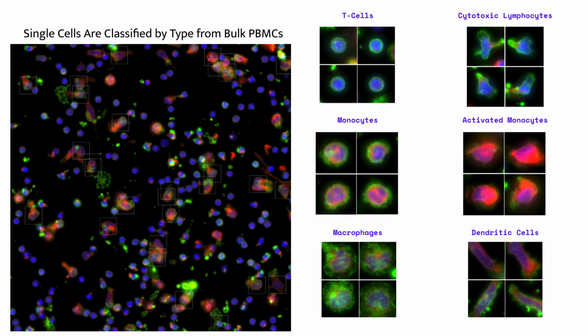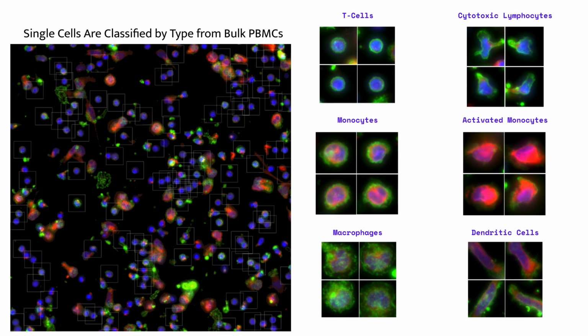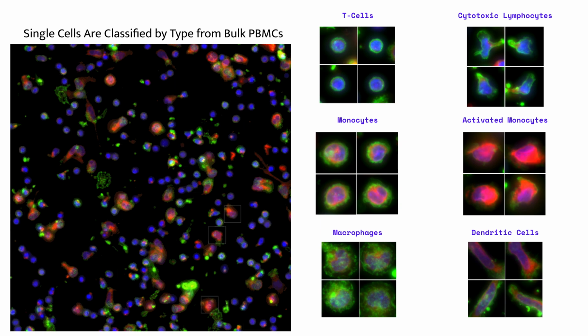One of the first targeted features we looked at was cell composition. We trained supervised and unsupervised algorithms to quantify changes in cell composition. We measured shifts in different immune cell types. A lot of these classes were shown to significantly correlate with traditional flow cytometry markers.